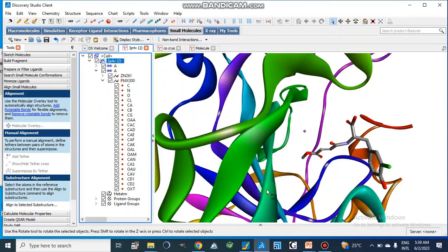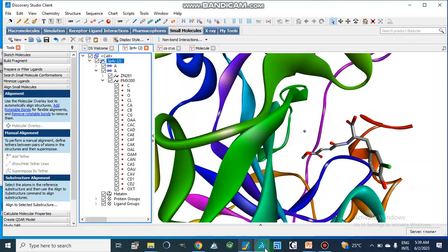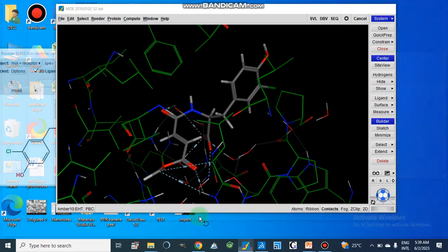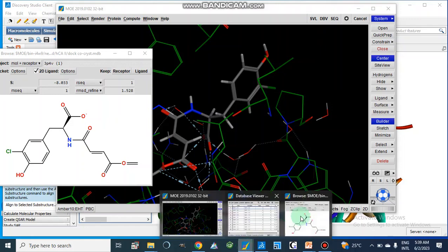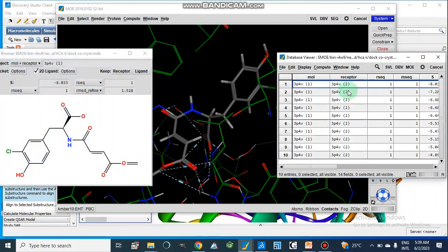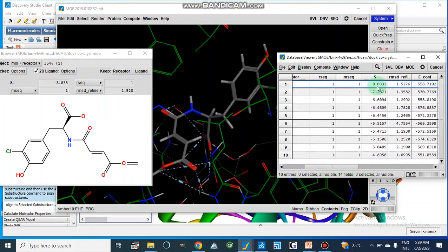When we dock this compound inside the active site of this enzyme, the structure will bind inside the active site and we will get our results. Here we have this co-crystallized structure, and after performing molecular docking we take a pose. The minimum energy of this docking pose is minus 8.0332.